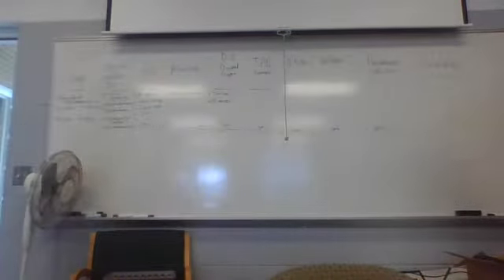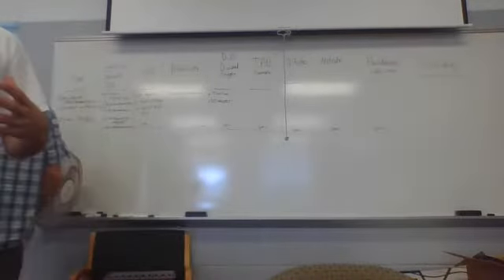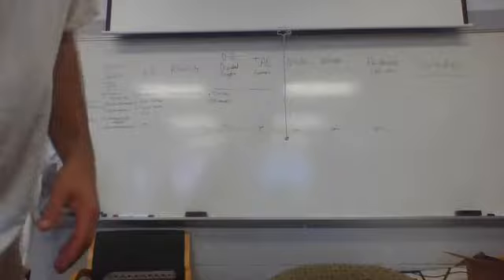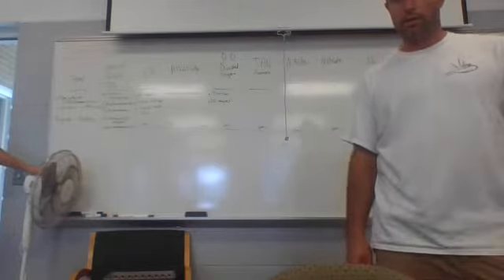So multiple different kinds of dissolved oxygen meters, all kind of using some sort of conductance or kind of direct measurement of the oxygen in the water through the light penetration.